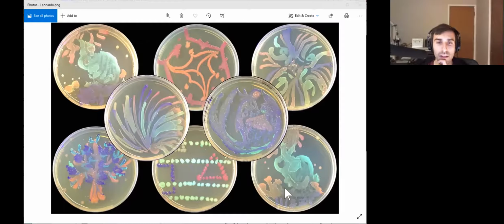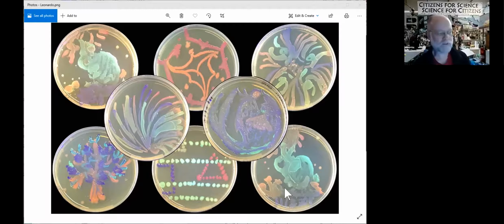Yeah, I wonder how your results would differ if you mixed the liquid broth together, 50-50, versus if you just did that technique you described. I think because these strains are so compatible with each other, if you know the cell counts in each, you can probably just do a 50-50 mixture and have it come out exactly the way you expect it to.